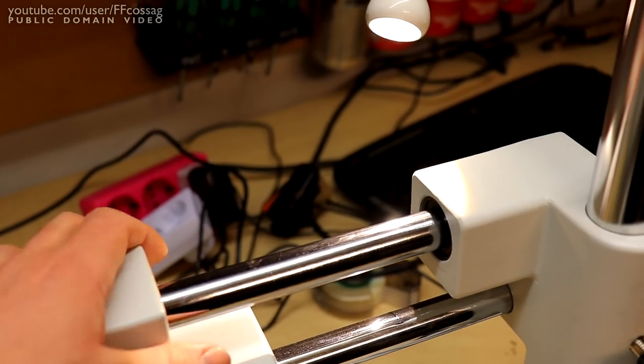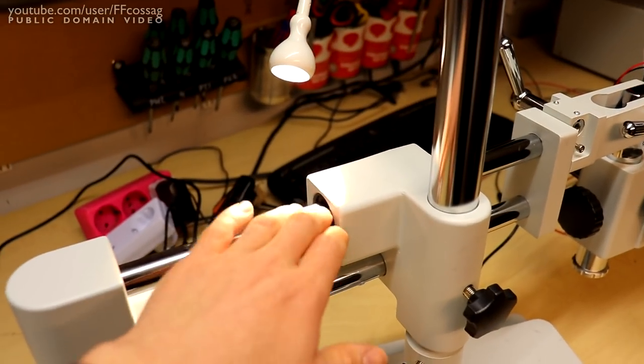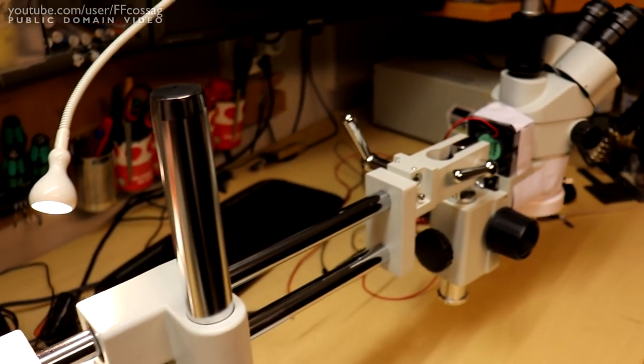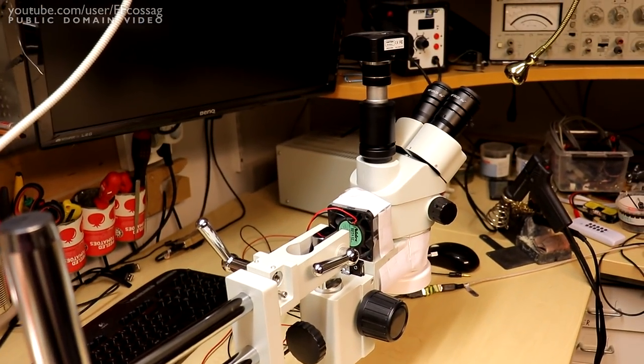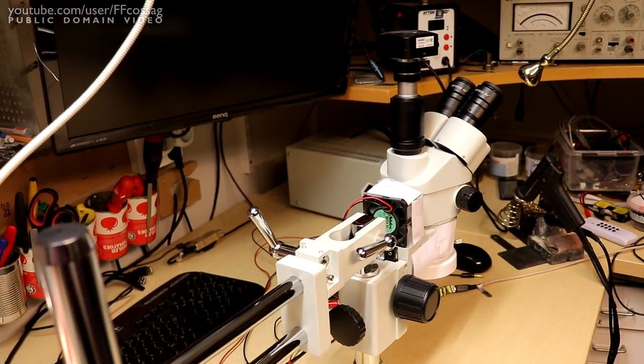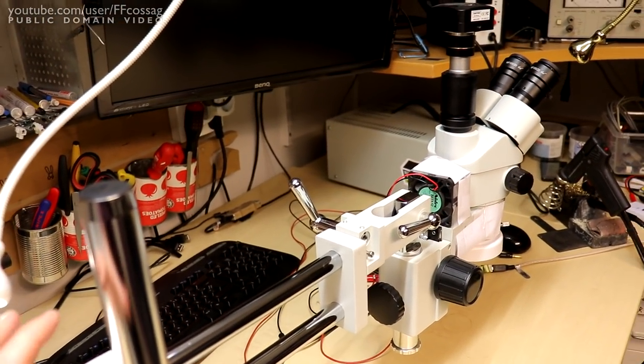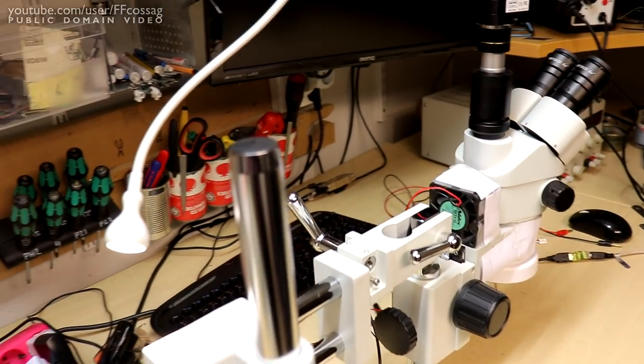As a result of that, combined with a bad bearing in this assembly, my microscope basically became unusable. The amount of force required to move it as well as the coarseness of the movement makes it unstable. It'll just shake violently if you try to use it at any speed.